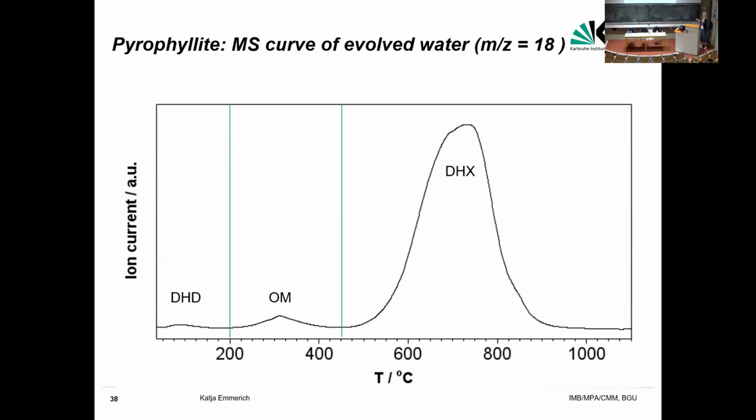But you see here, it starts below 600 degrees Celsius and doesn't end up to 900 or even higher temperature. So you need this information on the particle size, or you also have to think about if you're studying an aggregate, compacted sample, whatever. This can influence the thermal reaction.